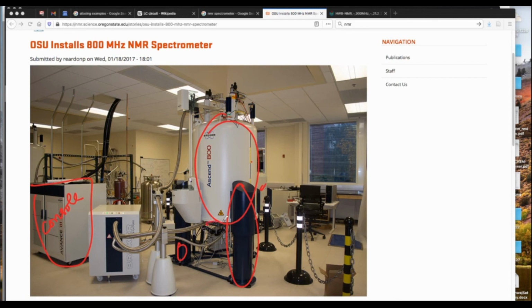The probe is right there. You are able to see the connectors. And in here, this is actually a cold probe, which helps in recirculating helium in these pumps. This is a big pump. This is called a cryo platform. So as you are able to see here, this helps helium being cooled to 20 Kelvin be recirculated.